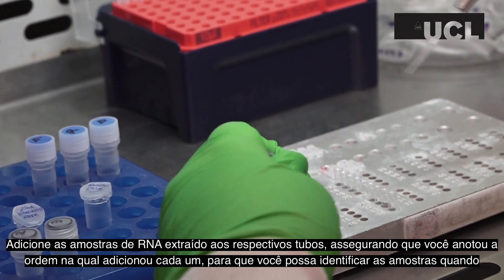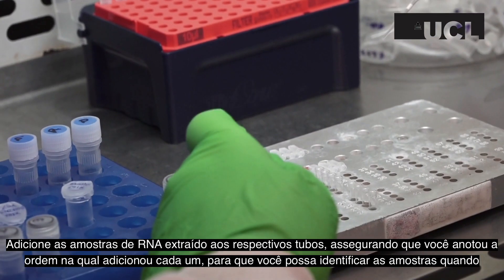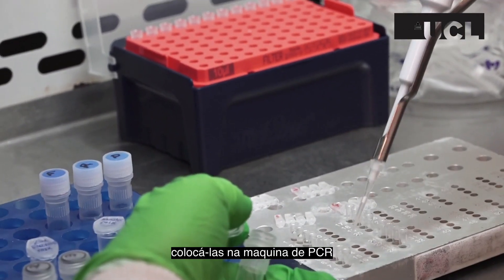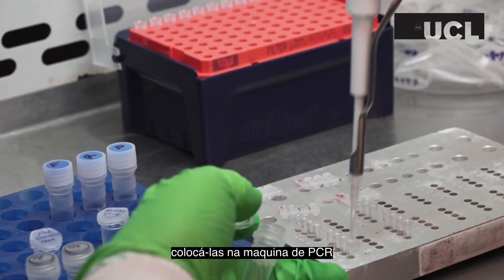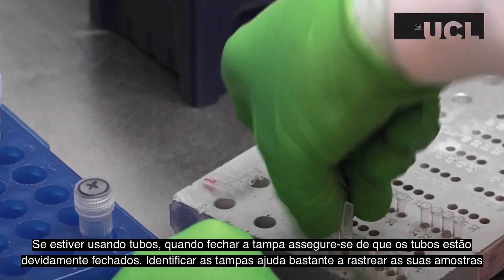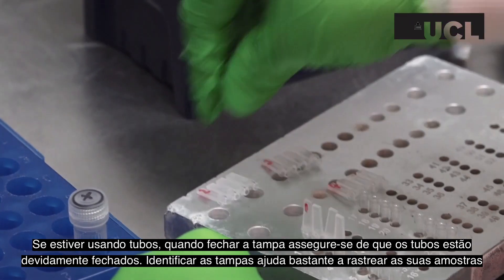Add your extracted RNA samples to the tubes, ensuring that you have made a note of the order in which you add them, so that you can keep track of them when you place them in the PCR machine. If using tubes, ensure you carefully but firmly place the lids on top. It is helpful to label the lids so you can keep track of the samples.